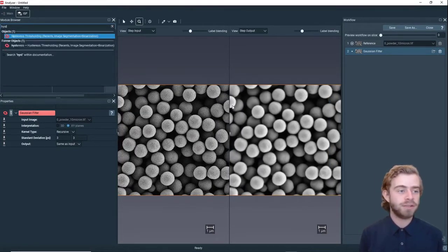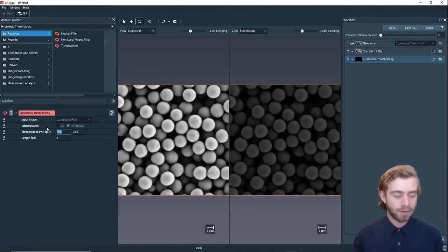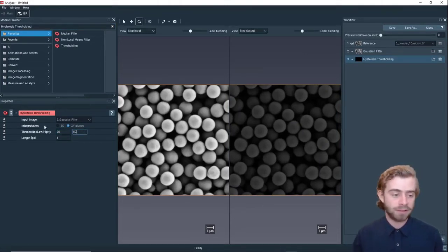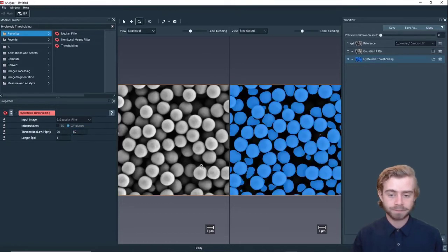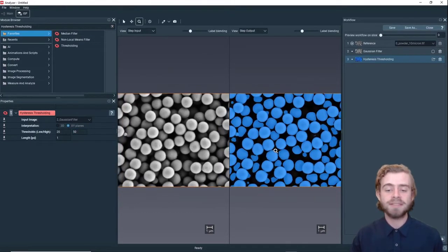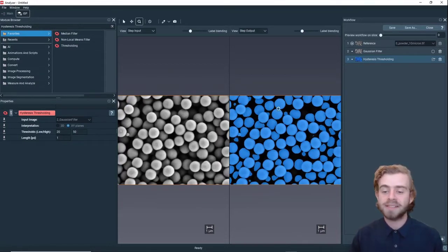The next thing we're going to do is use Hysteresis Thresholding, and we want to set the low threshold to 20 and the high threshold to 50. What this does is it segments out each of the powder particles, but there are some problems — we can see that some of the particles are connected.